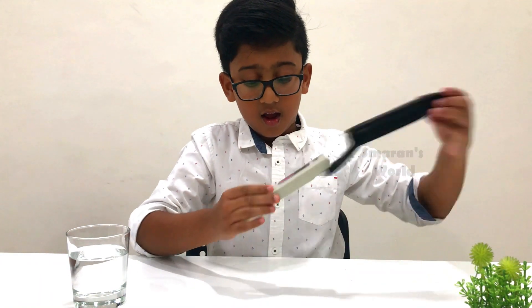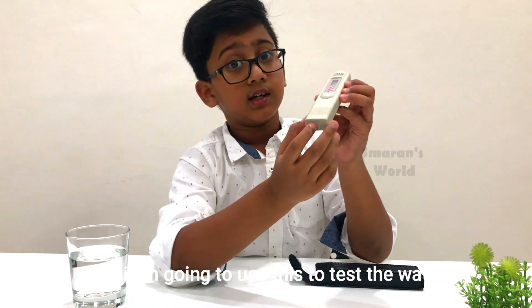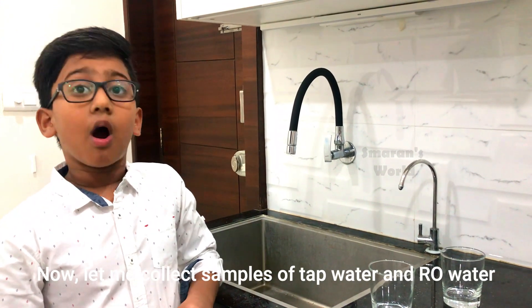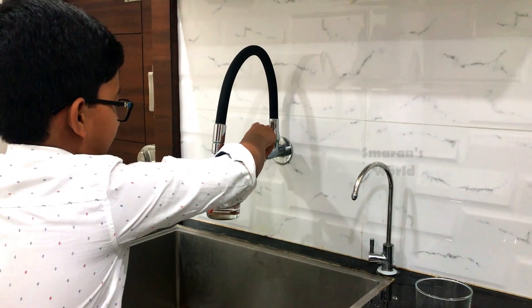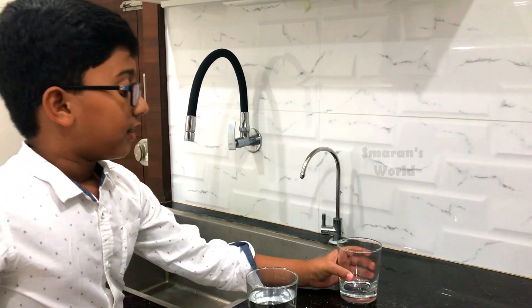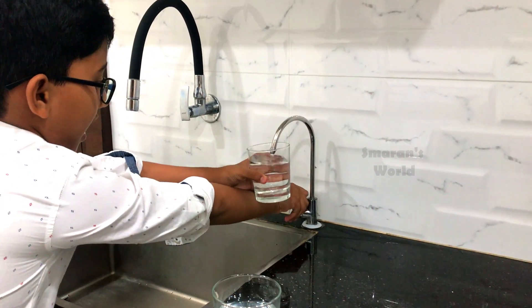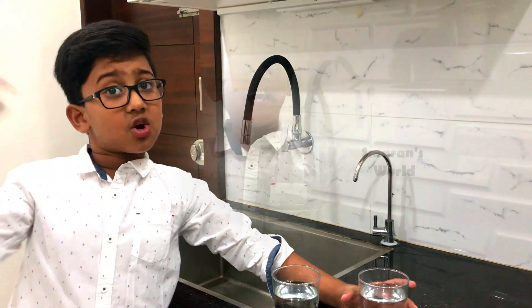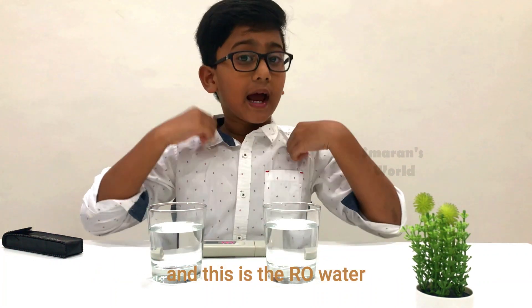Here is a TDS meter, and here is how it looks. I am going to use this to test the water. Now I am going to get some samples to test. Let me collect some of the tap water in this glass. This is the tap water, and I am also going to collect some water from the RO. This is tap water and this is the pure water. Here we have the samples — this is the tap water and this is the RO water.